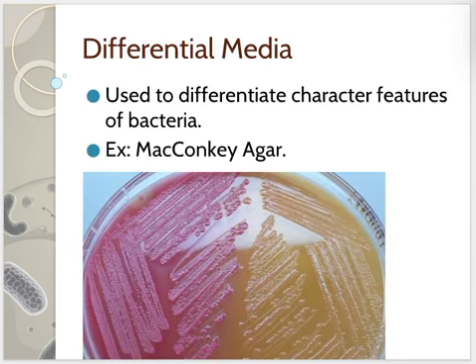Differential media help us distinguish bacteria based on their characteristics, such as metabolic activities. For example, McConkey agar differentiates bacteria by producing colonies of different colors, depending on their ability to ferment lactose. This visual distinction is valuable because it allows us to identify and study bacteria more effectively without complex testing.